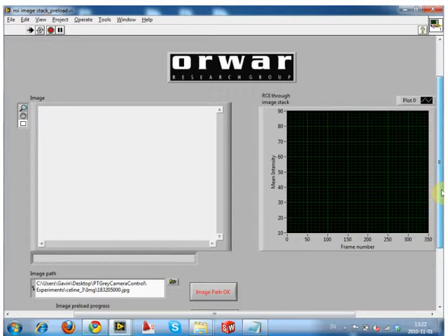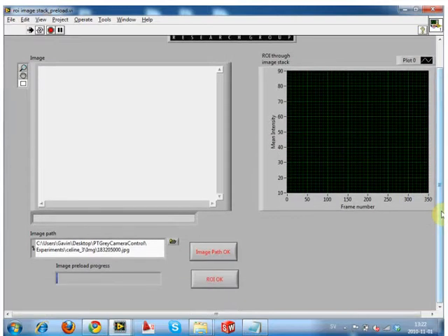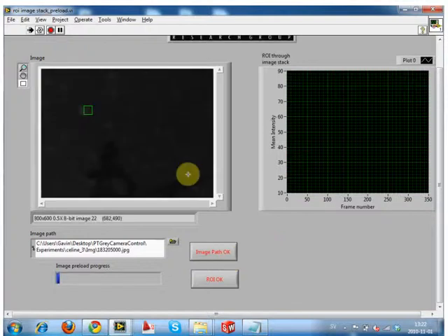I've modified that set of images with other things, like some extra random files, to show that they are not included in the file list. But with this one, I don't want to show that. So now it's doing what it was doing before, and it's going to load up all these files. Wow, there's a lot of files in this folder.